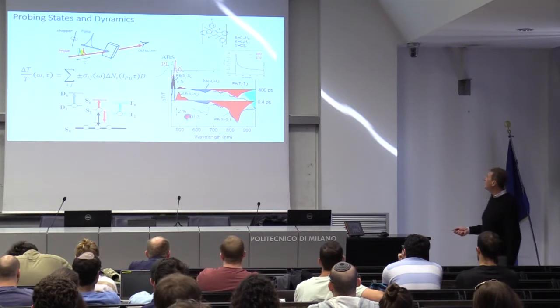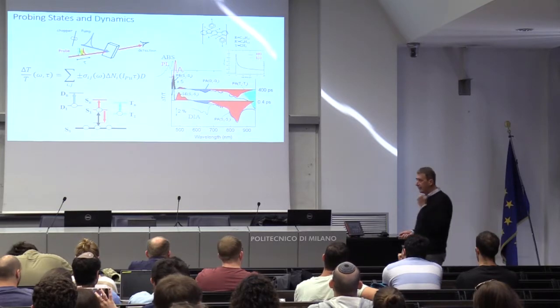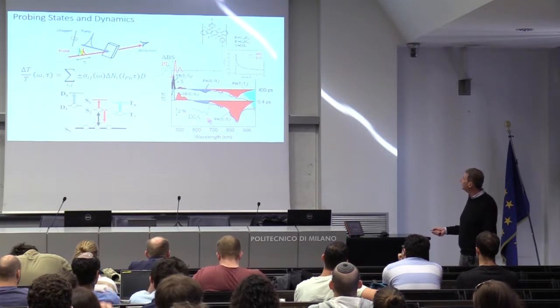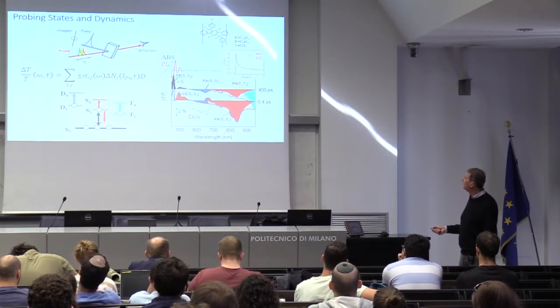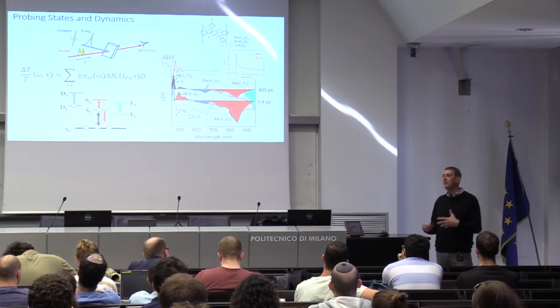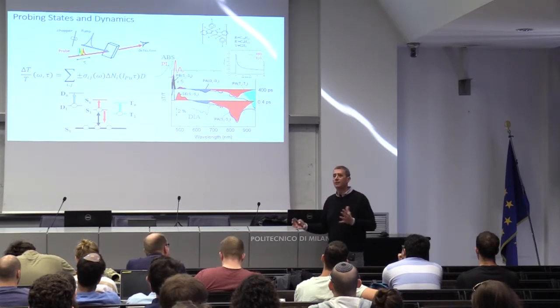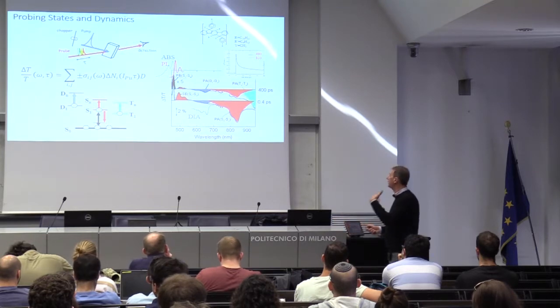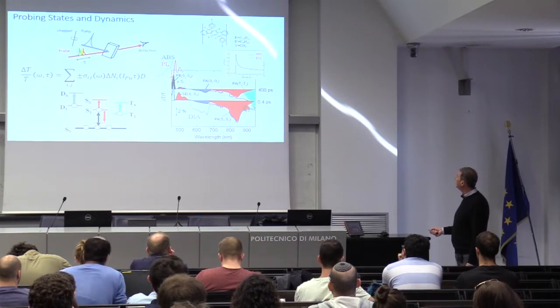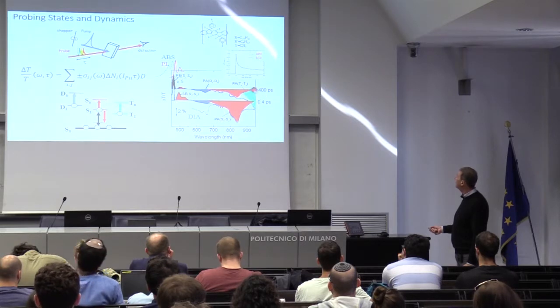What is it? Well, if I do a chemical doping, which means I insert or take away charge, so I induce charge, or photoexcitation, I see exactly the same spectrum. This is the doping-induced spectrum, and this is the photo-induced spectrum. You see it's the same position, the same shape. So that is a charge. So it means that some fraction of the excited state is forming charges. So we have singlet, neutral, charges, and then there is another peak here, which is interesting, is there from the very beginning, but is obviously taking over. You see, it is the largest at 400 picoseconds.